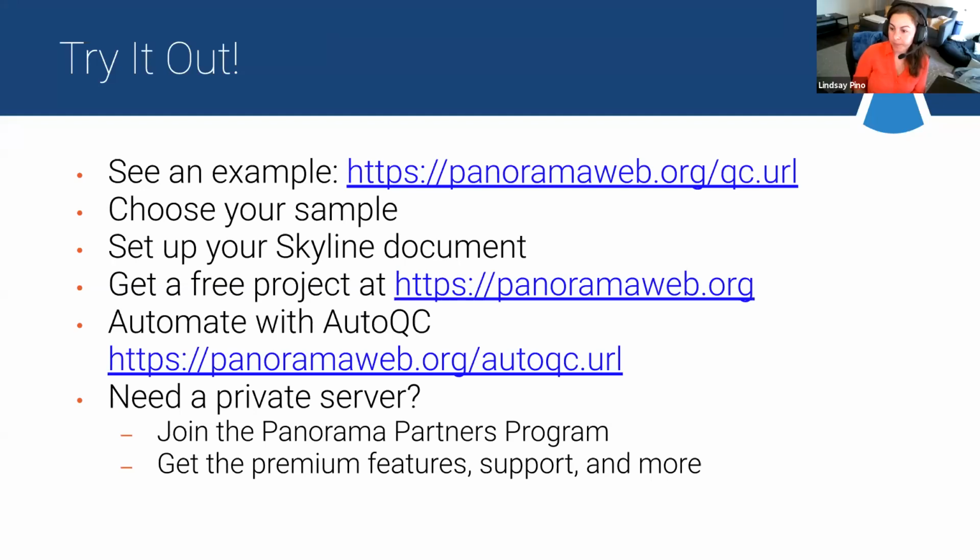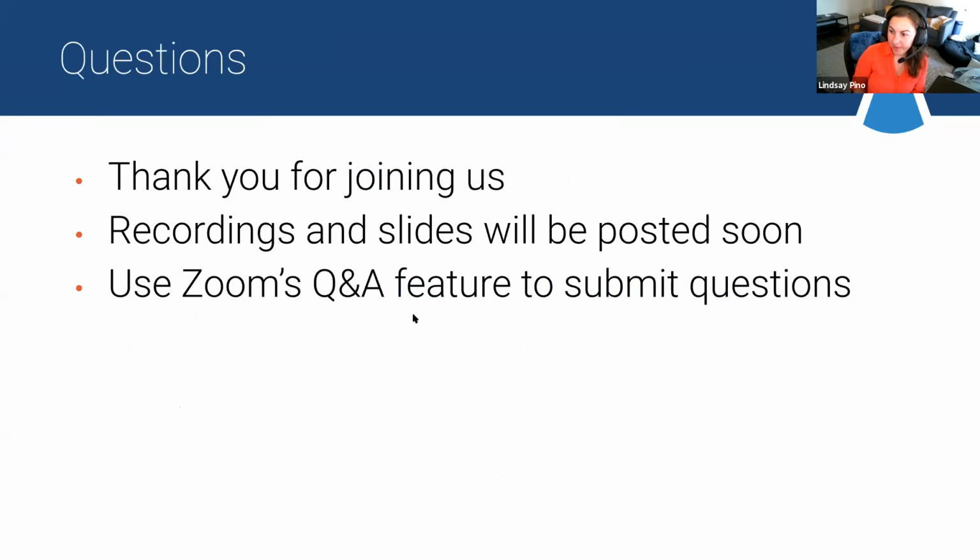I think that's pretty much all the questions. There's a couple questions in here. I see Brendan answering a Skyline question. We got a question that sounds like maybe more of a specific question about this person's needs troubleshooting their AutoQC.